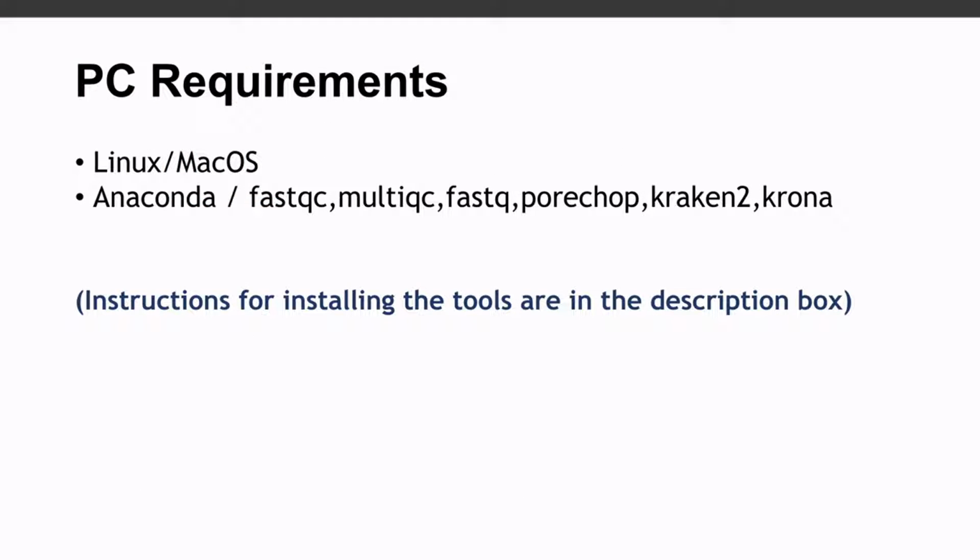In order for you to follow this tutorial, you need to make sure you have a Linux or macOS system. And you should also have Anaconda installed. We are going to use Anaconda to install the tools, which are here. But if you have the tools already installed, then you don't need to have Anaconda on your system. That's what you need to know.